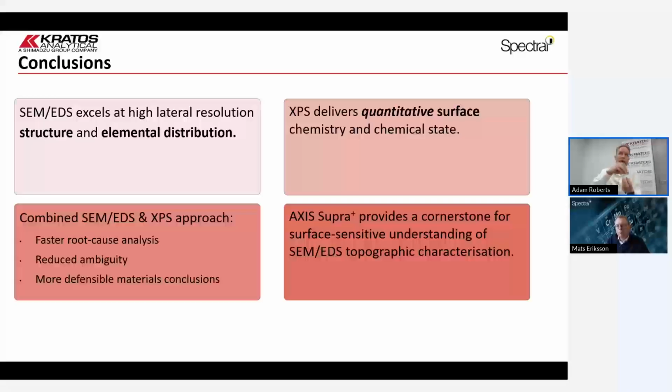There is also a second correction that you must do for the transmission function of the spectrometer. That's the probability of getting that photoelectron, once it's been created, from the surface to the detector. So there are a couple of corrections required. But in general, XPS is seen as a reasonably simple method for quantification, right? It's well suited for quantification. Yeah, that's right. That's the take-home message.